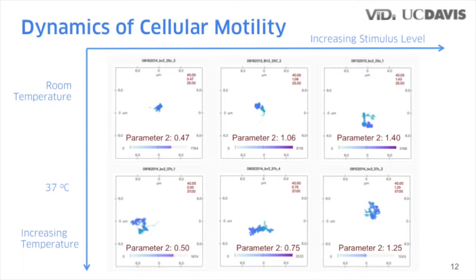The data collected at 37 degrees Celsius suggests that either a minimum level of stimulus causes maximum activation of cellular mobility, or the cells are already activated at the physiological conditions and their activity cannot be further increased. The visualized data point out that further control experiments have to be done in order to find out the relationship between the temperature and activation of cell mobility.